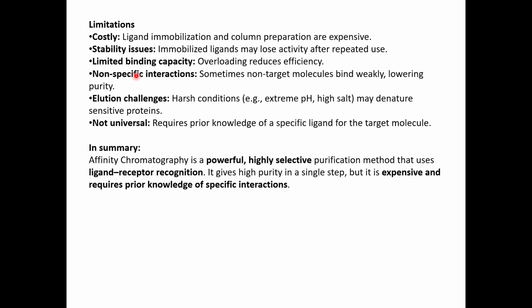It's quite expensive because the column itself is pretty expensive, and then you need to have your specific ligands, and the ligand immobilization and column preparation is the most expensive part of it. Then stability issues.